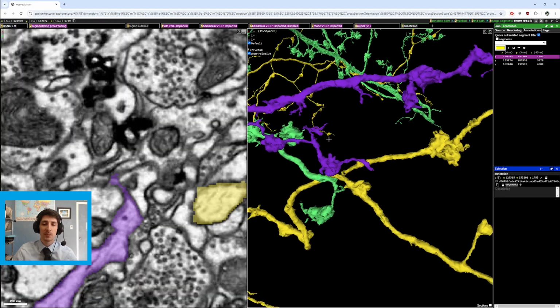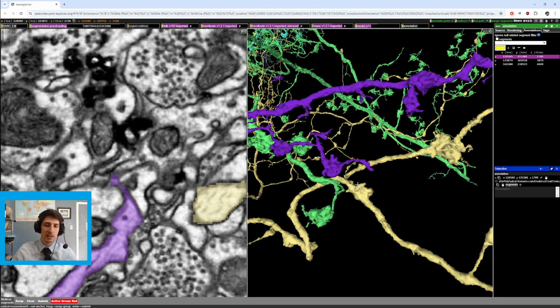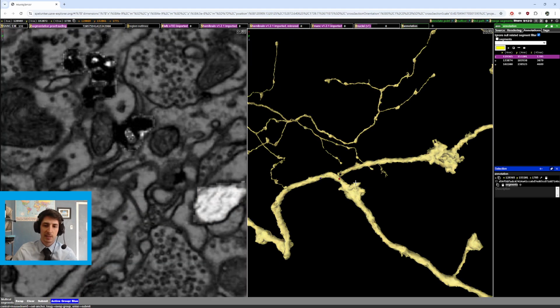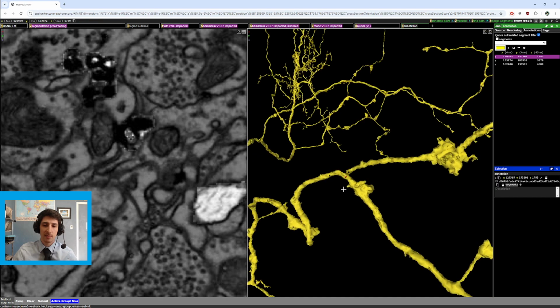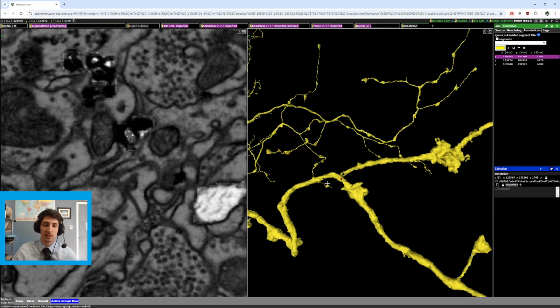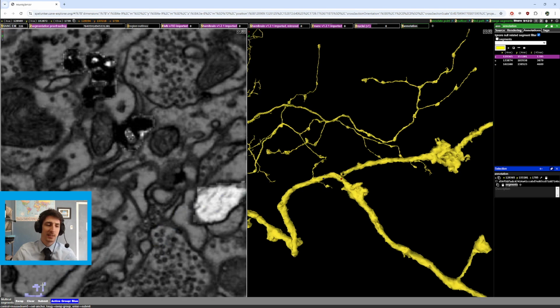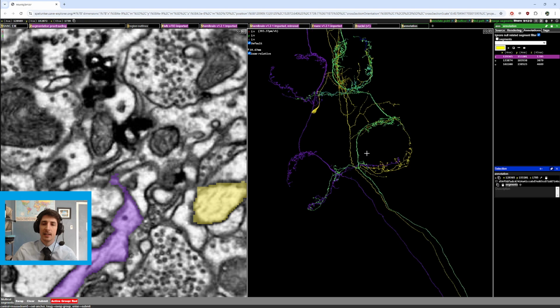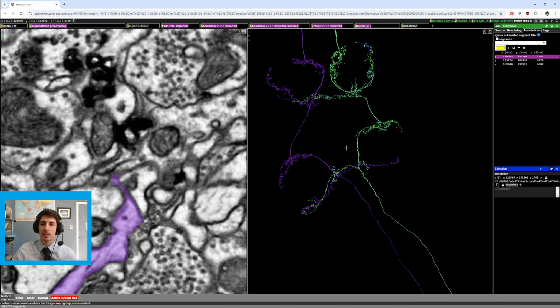So what we would do is we would split this. You could hit the C key. You could drop a point on here. You're probably going to have to split this from this and this from that. Unlucky or unlikely that you would get it in one split, but 2 splits only takes about 10 seconds. But we're going to save this for training purposes. So get rid of that.